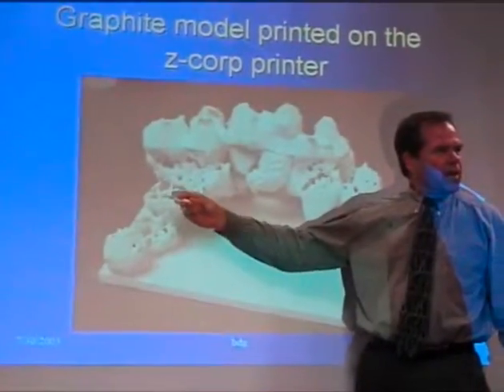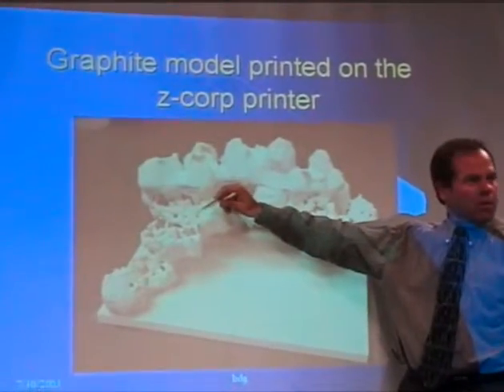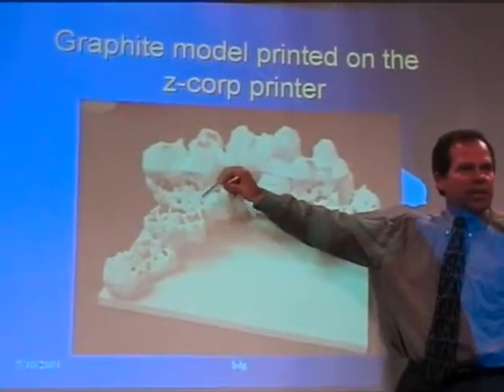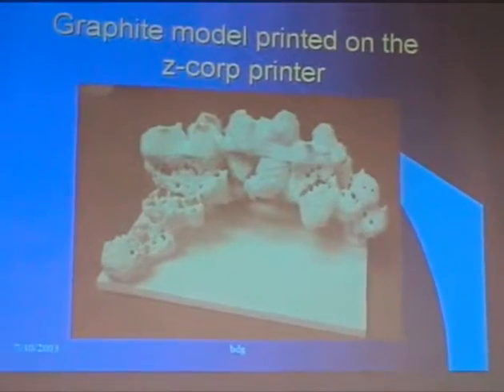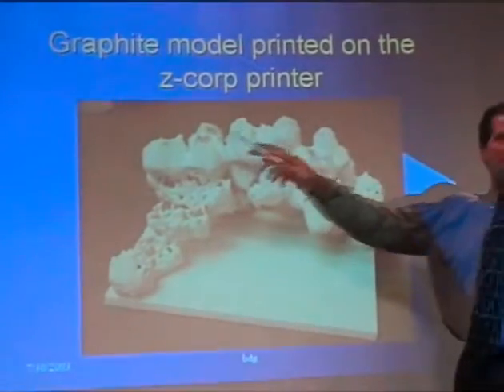And so what's cool about this, for carbon, and I was very excited when I saw this, is look, now we can get an idea of how big the internal area is in this particle. We can get an idea of how big the pores are. Here's a pore. So now we can start to understand hysteresis in these very complex nano-sized particles by looking at a three-dimensional build model.